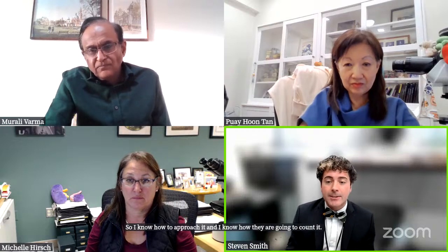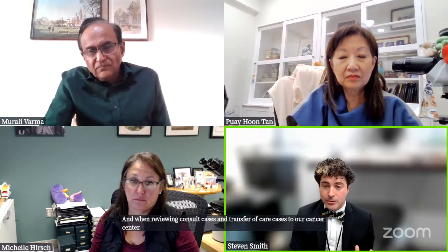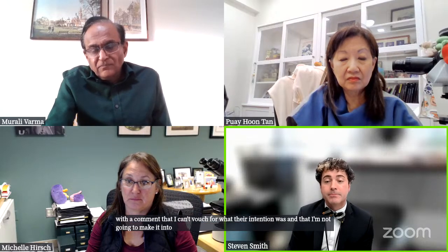Because if I accidentally say 20% of 2 cores and it's fragments, if you go by national practice guidelines, you might be impacting someone's active surveillance criteria. So you've really got to know what you know. And when reviewing consult cases and transfer of care cases to our cancer center, I very often will describe it as involving X percentage of the tissue sampled from this site, with a comment that I can't vouch for what their intention was and that I'm not going to make it into cores for that reason.